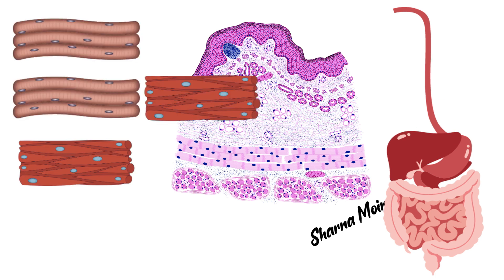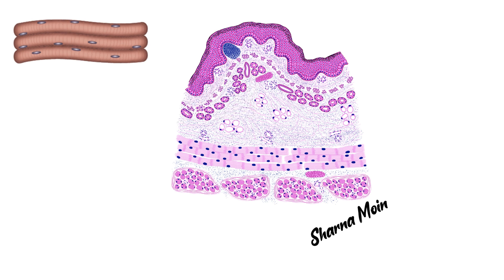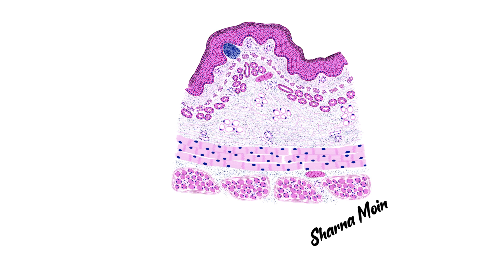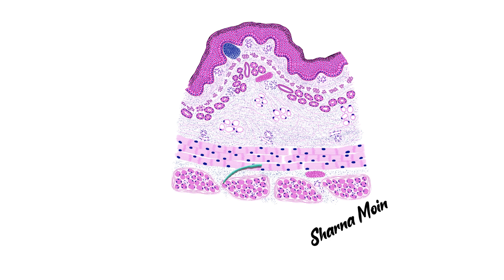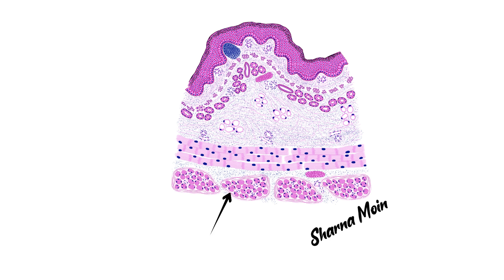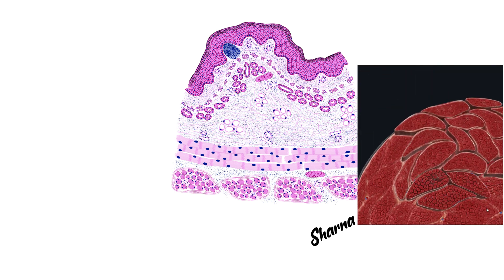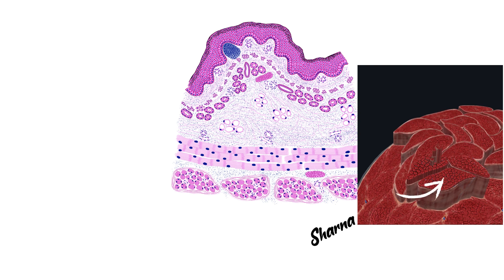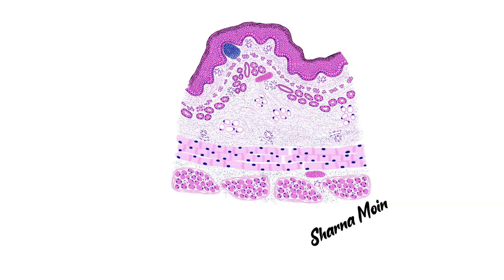Now I'll show you how to identify skeletal versus smooth muscle. Skeletal muscle fibers are long, cylindrical, and have peripheral nuclei. In the inner circular layer you can see the long fibers with peripherally placed nuclei, and if you observe more closely you will find cross striations — so this is skeletal muscle without any doubt. In the outer longitudinal layer, the fibers are placed in bundles called muscle fascicles, which are covered by perimysium. The nuclei are situated peripherally, so this slide shows only skeletal muscle — this section is from the upper one-third of the esophagus.